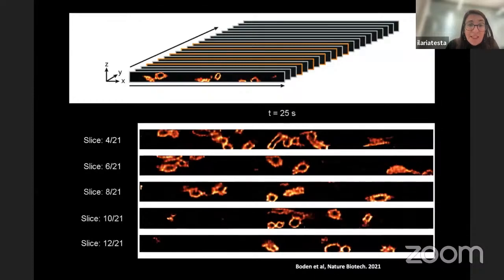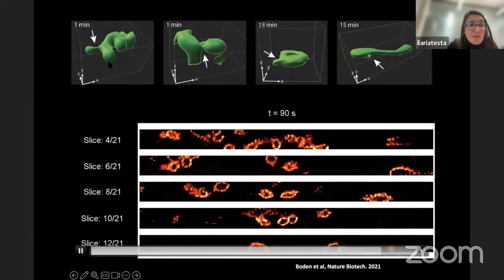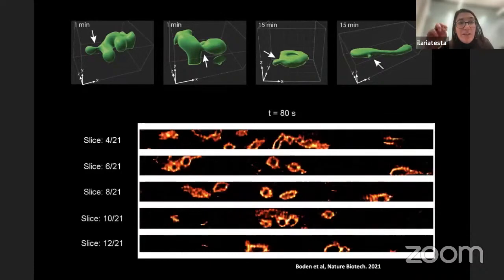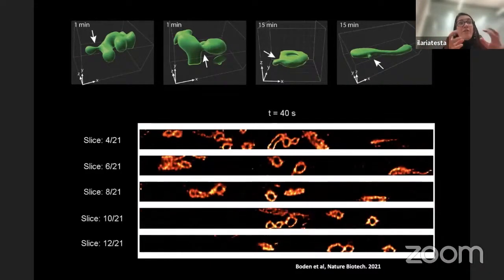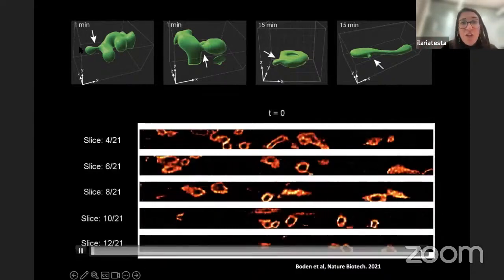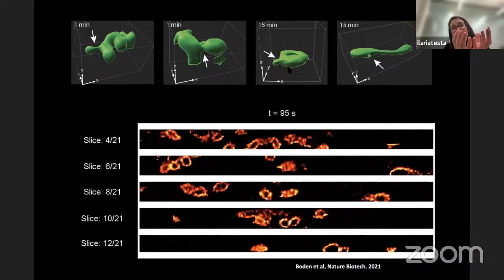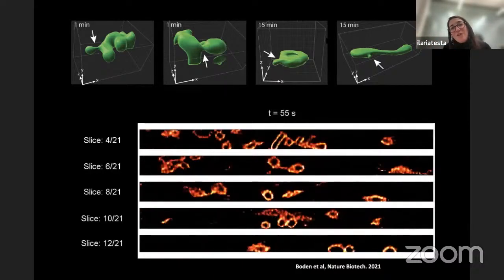And again, this can be done live. Those are all live cells. So you can also perturb the system and see how they behave. You can say, hey, mitochondria, stop breathing, and then I'm going to check how you react. At the beginning, they start this fission, so they divide, and then they start forming this fancy shape that I think physically has a lot of meaning, where they make the membrane fuse, and you get these horseshoe type of shapes.